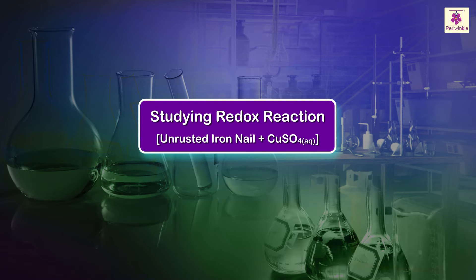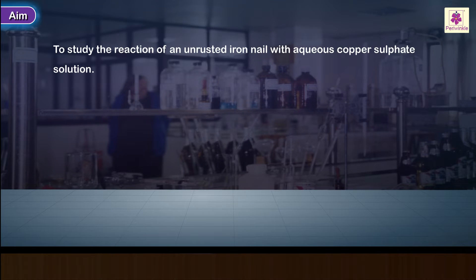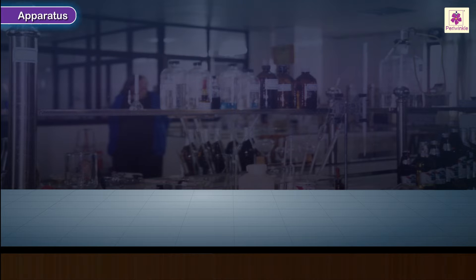Studying Redox Reaction. The aim of this experiment is to study the reaction of an unrusted iron nail with aqueous copper sulfate solution.